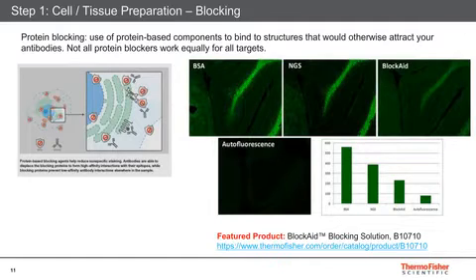After you've permeabilized, then you go on to your blocking. I'll spend a little bit of time talking here about the different blocking techniques. Usually when you say blocking, like for an antibody, you talk about protein blocking. If you use an antibody on tissue that's not blocked properly, that antibody can bind to proteins other than the antigen that you're targeting. So instead, you first block with a protein blocker. In many cases, this can be bovine serum albumin, or serum, like normal goat serum that's been heat inactivated. Sometimes people will use others like fish skin gelatin or non-fat dry milk or commercial blockers. I have found that bovine serum albumin, maybe at 6%, combined with maybe a 3 to 5% serum, is a very good combination to knock down some of that non-specific binding by the antibodies.